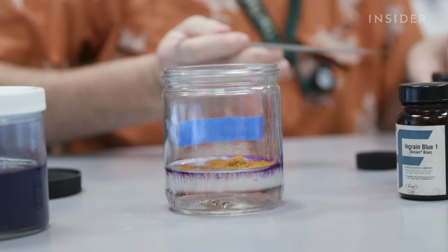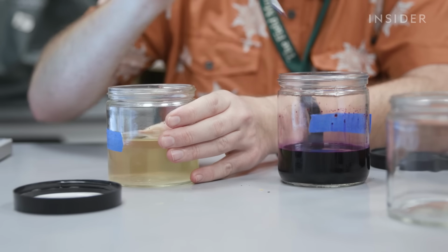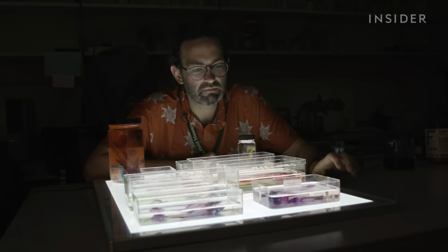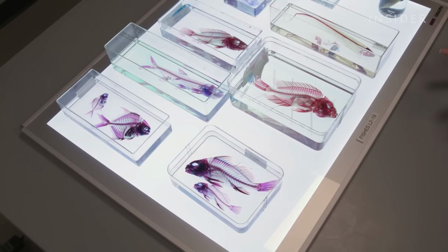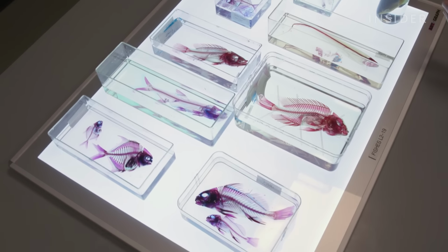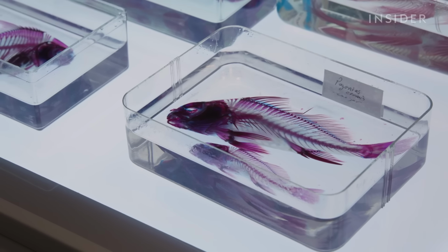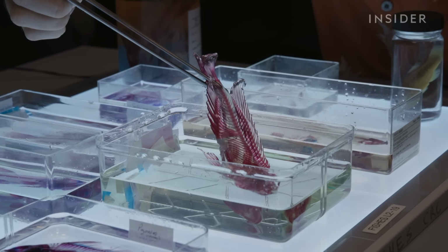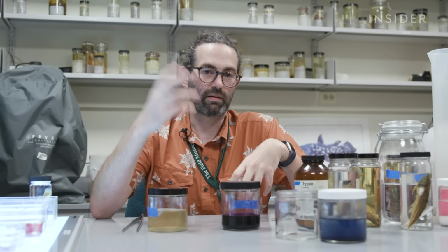One of the advantages of clearing the fish and then putting it into the red dye is you can keep an eye on it to see how dark it's getting. The whole process can run a few days to around a month. Done right, and your final product are these almost alien-looking specimens. It's kind of like Jell-O. And you store it in glycerin in the end because glycerin and collagen have the same refractive index, or the way that light passes through.